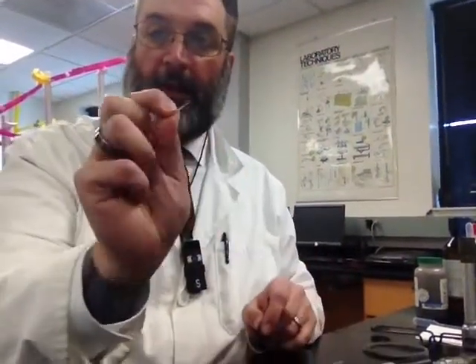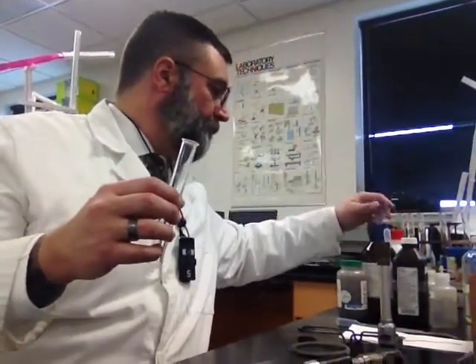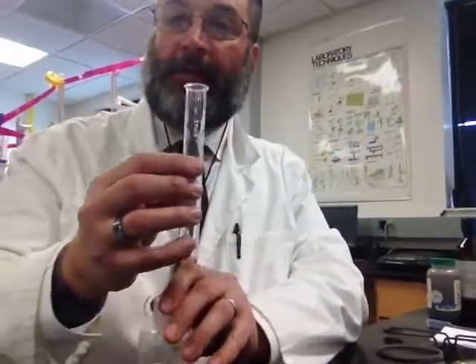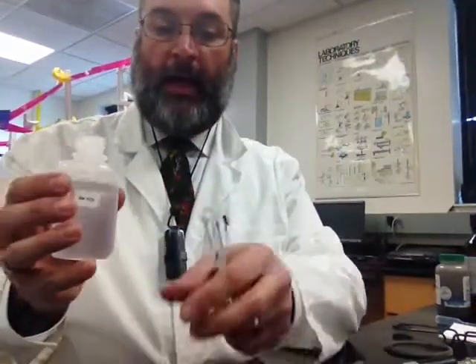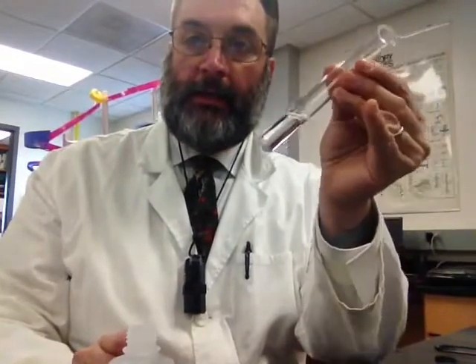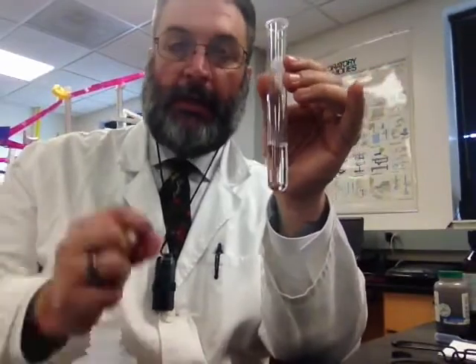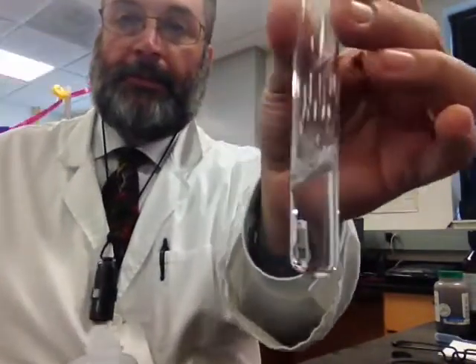So, same stuff, magnesium metal. And I'm going to use some hydrochloric acid. Okay? So I'm going to take a little bit of hydrochloric acid, HCl, right? And I'm going to put it into a test tube, and I want you to look and see what hydrochloric acid looks like. Okay? Remember, we say clear and colorless. Okay? Clear is that I can see through it, and colorless is that it has no color. And I'm going to take my little piece of magnesium metal and I'm going to drop it in.